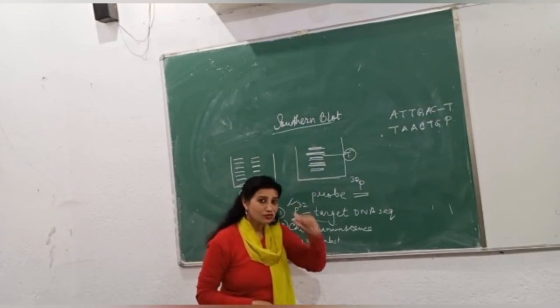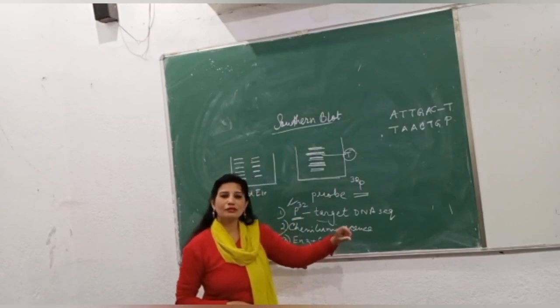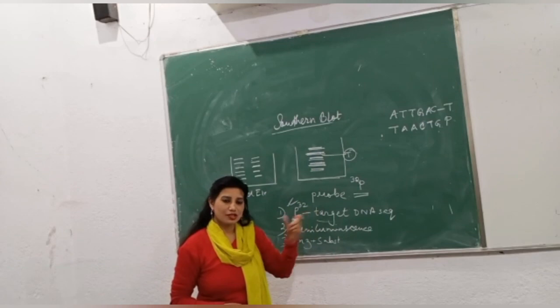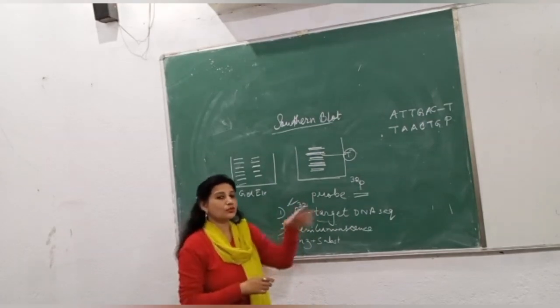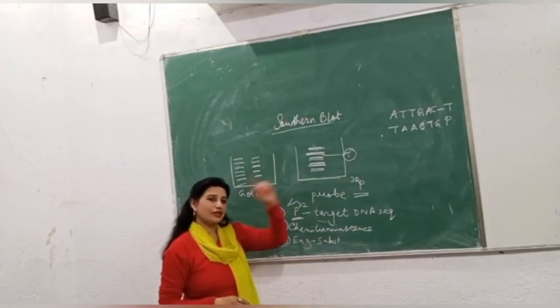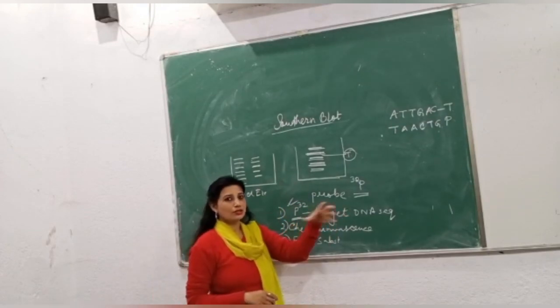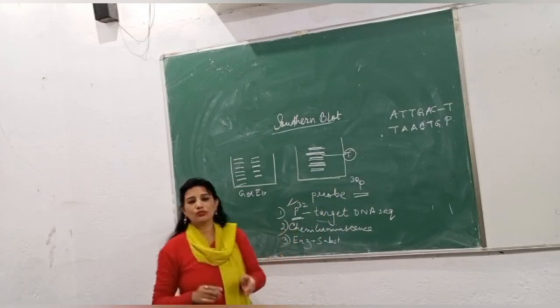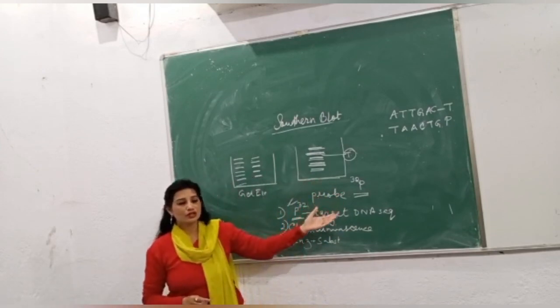And this method is really applied to detect the virus also, that is the COVID-19 virus, by the kits that are used. And that probe is also giving some fluorescent color. So this method is getting used. Only that is a different section. Totally it is not the same thing, but that method is used. So I hope you have understood this Southern blot.